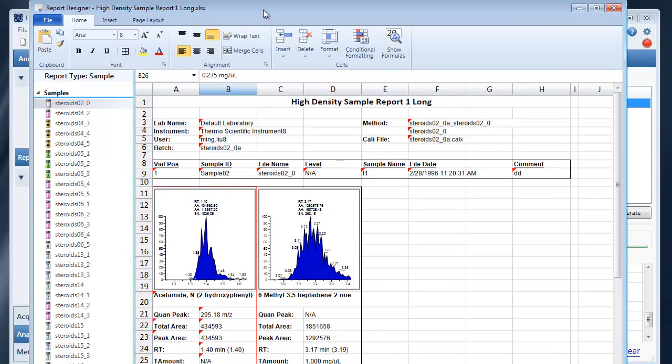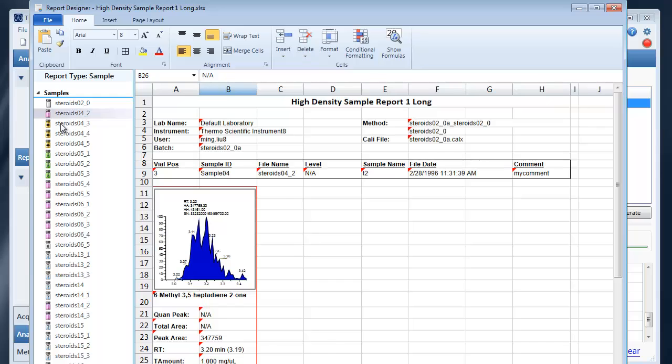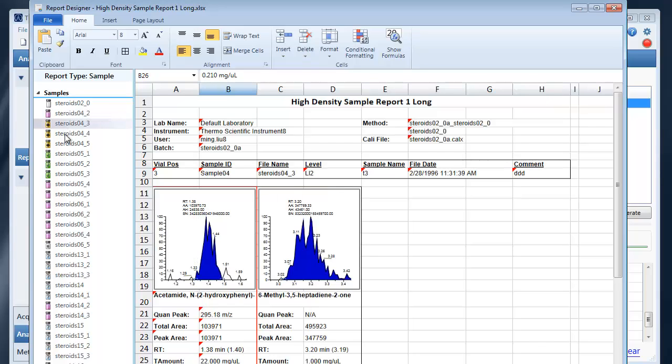When the designer surface opens you'll see on the left hand nav a list of samples and/or compounds depending on your compound type and depending on your reporting type.